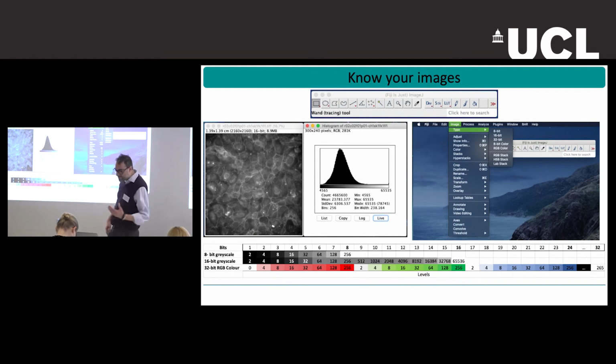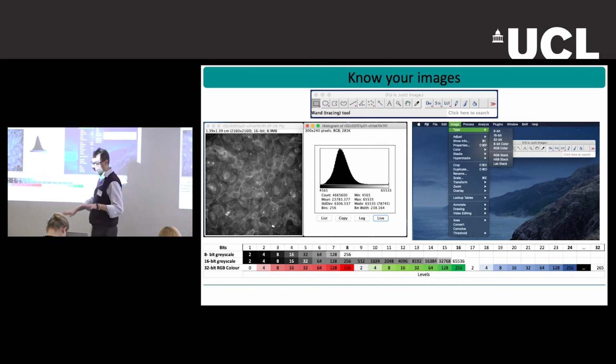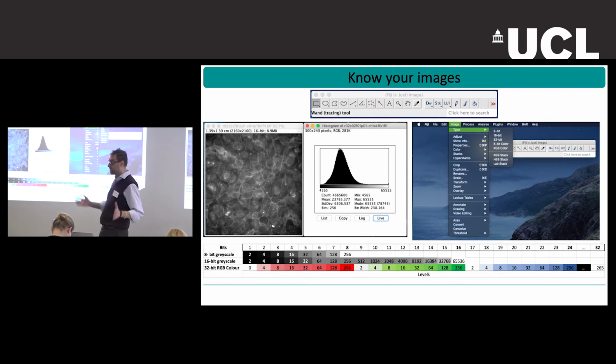And the computer will have memory problems, in particular when you handle a bunch of these images. So here we come to the concept: when you really need huge images, it's way better to do all of this in a facility, because normally this laptop won't be able to handle, or will take a lot of time handling, a huge number of huge images. But you can work with this easily if you need it.